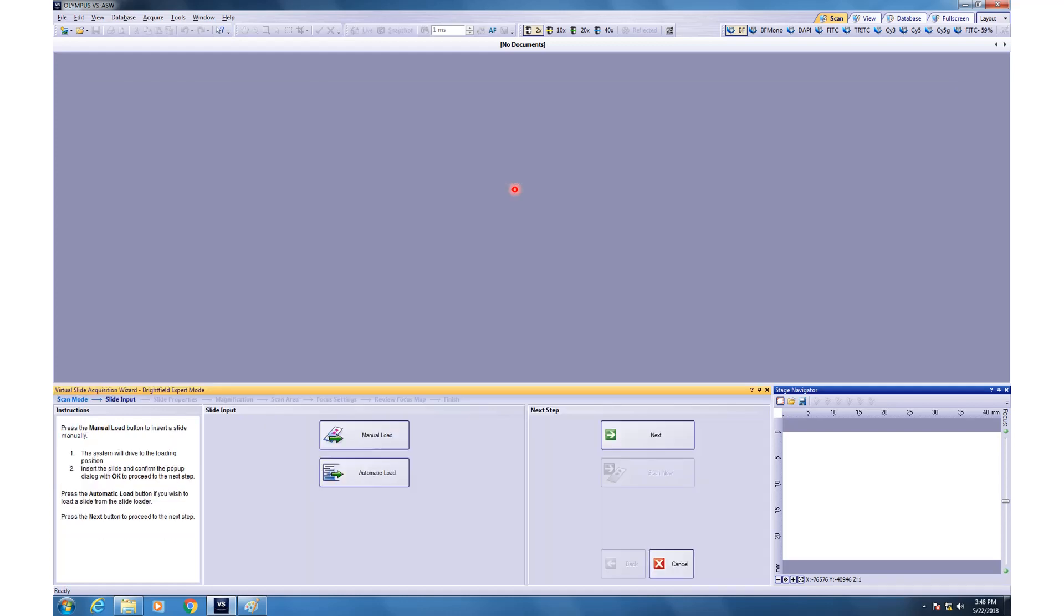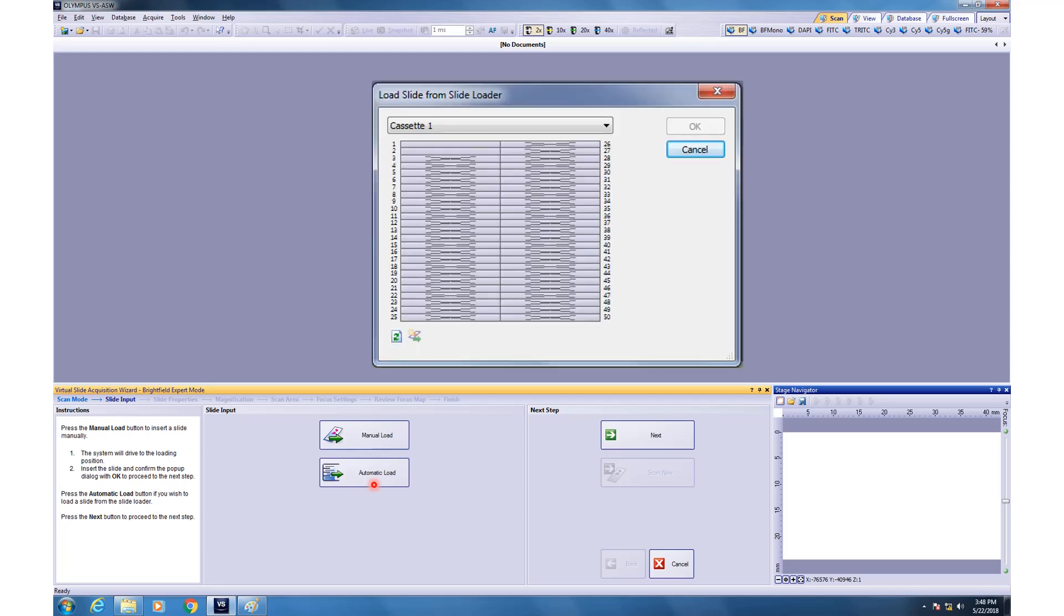Once you do that, then this is what it will show either to load manually or to load it automatically. Usually, we recommend doing automatic load. So, if you click that, then it will scan through. It will make a beep kind of a sound and after some time, this box will open where you can see the options like the locations where the slides have been loaded. So, click on any of the option that you want to like or the slide that you want to image and click OK.